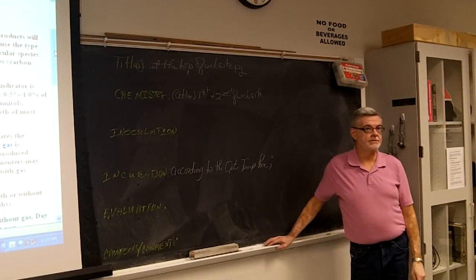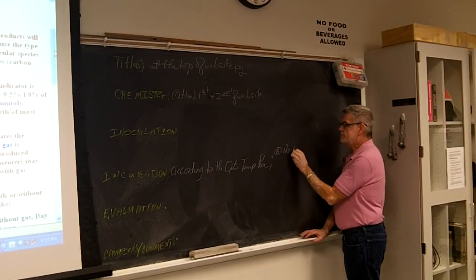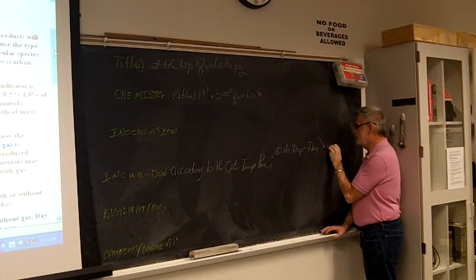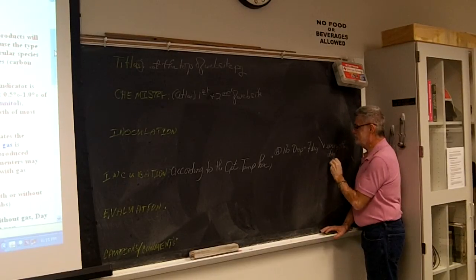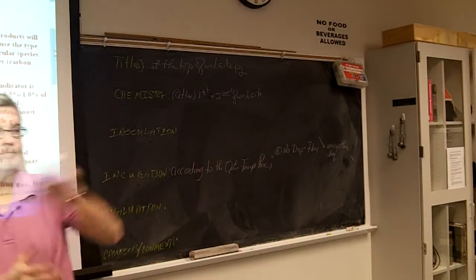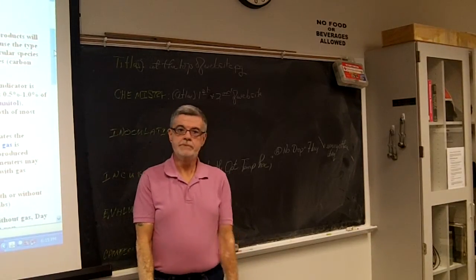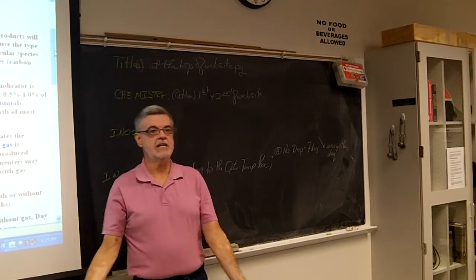And there's only two options of how long. No drops equals 7 days. Check every other day. So, those temperatures are in Celsius, correct? Yeah, always. On this one, does it say anywhere about adding any drops? No. It says it's given to you, you inoculate it, you stick it in, you cook it. It doesn't say anything else.